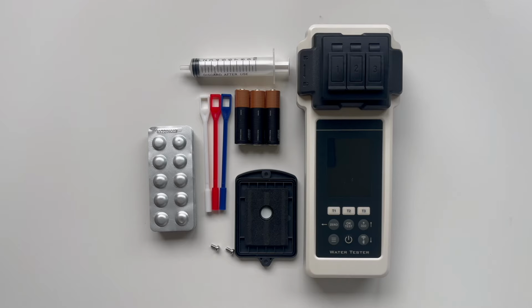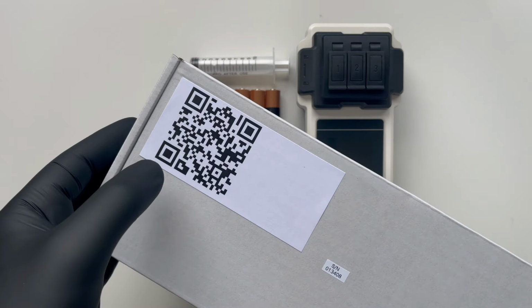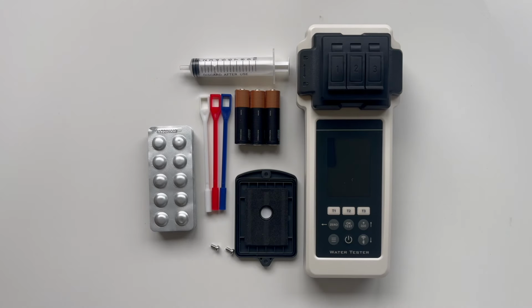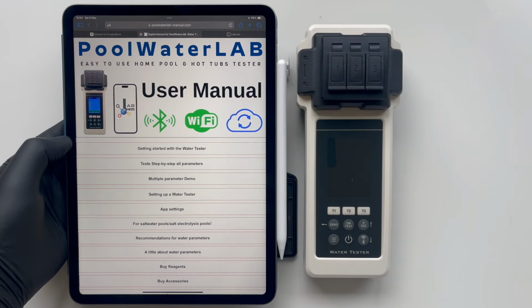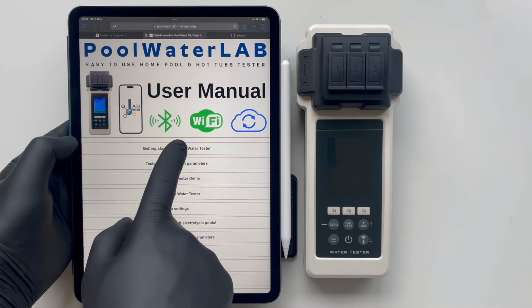First things first, begin by scanning the QR code on the box. You've received this box, and it has a QR code on it. Scan this code, and you will be directed to the digital instructions. In the digital instructions, open the first section, titled Getting Started with a Water Tester. This section provides detailed, step-by-step directions that will guide you through the initial setup process.